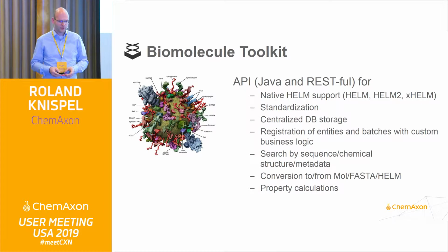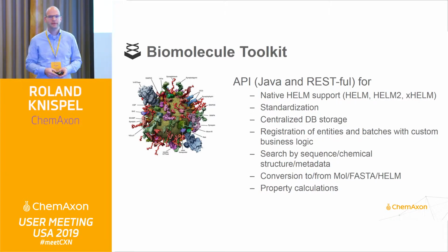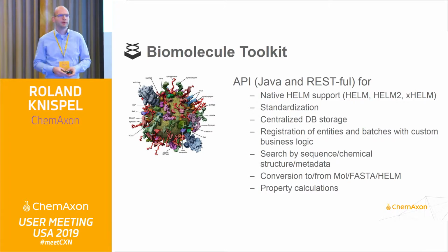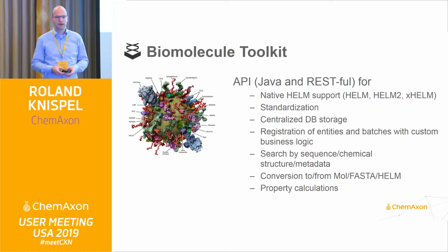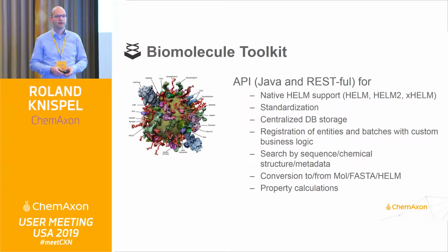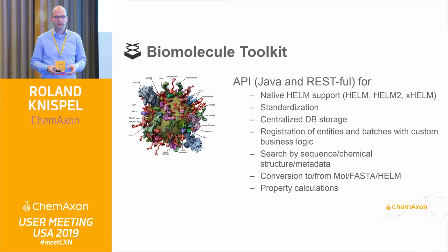It provides you with a database layer in order to deposit these things into a database. Obviously then coming with a search endpoint that lets you find specific sets of molecules within your repository, either based on chemical queries, say substructure queries, or sequence-based queries where you're looking for specific sequence motifs. But also, since you're able to deposit these molecules together with additional metadata, we also have filters that bring back results based on this metadata.